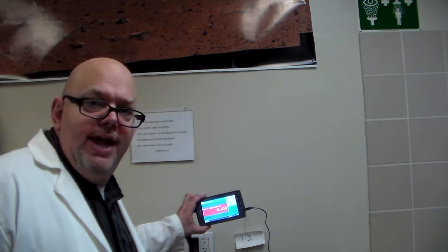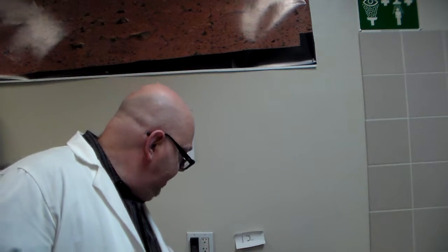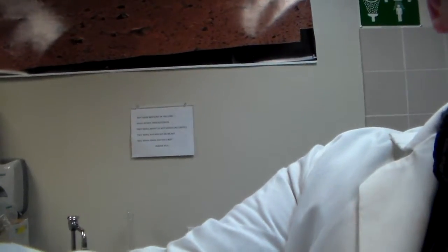All right, now I need to introduce you to a couple more pieces of equipment that we're going to be using. You guys already know the LabQuest. You know that one already, but there is another piece. And for that, ladies and gentlemen, I'm going to take the camera off its mounting. All right, so here we go. Blair Witch Project, here we go. Camera style of the Blair Witch Project, it's a reference.